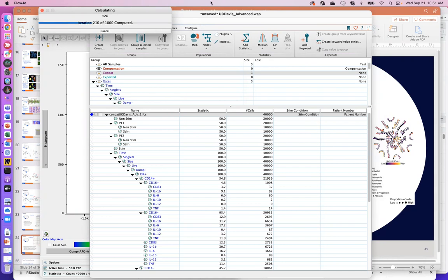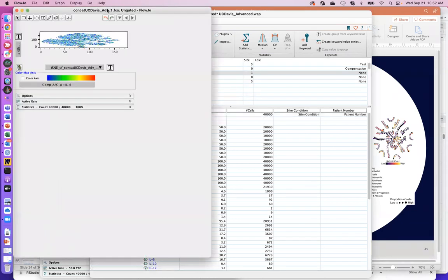Okay, now it's going to take a few seconds here for us, maybe 30 seconds to complete. So I'm going to check the chat box real quick. And I don't see anything there, so we're okay. But if you have any questions, by all means, go ahead and ask. And as I said, if we have time, we can probably do a UMAP, and maybe I'll run the UMAP after we run the t-SNE, and then we can do some fancy stuff in the layout editor while the UMAP is calculating. And then you guys can make the decision for yourselves which one you prefer.